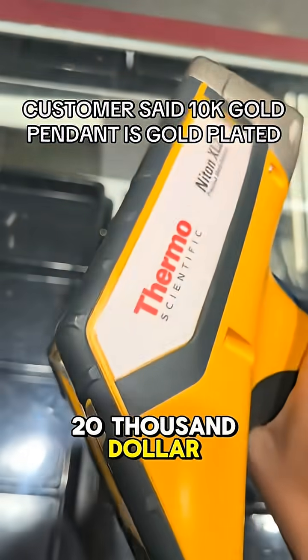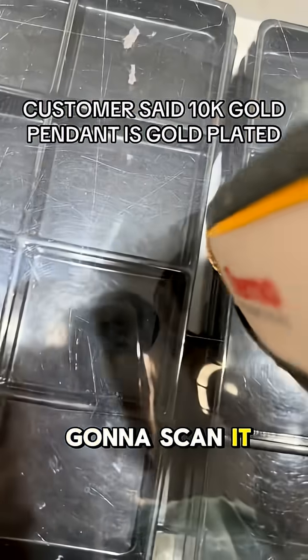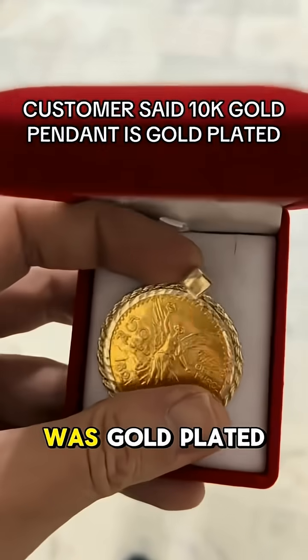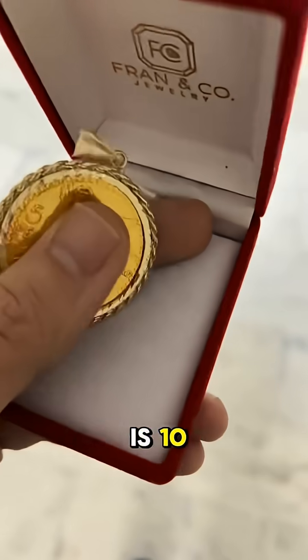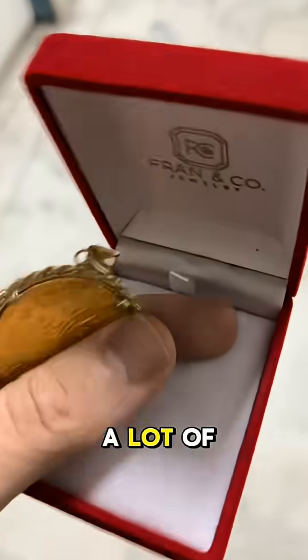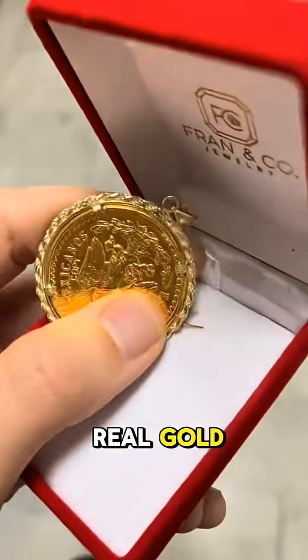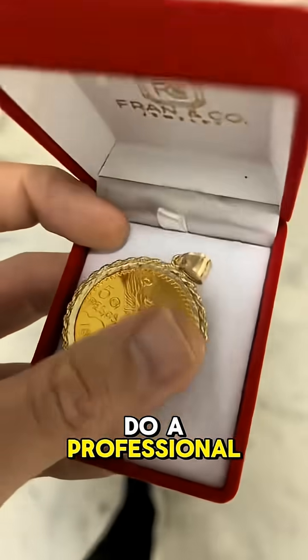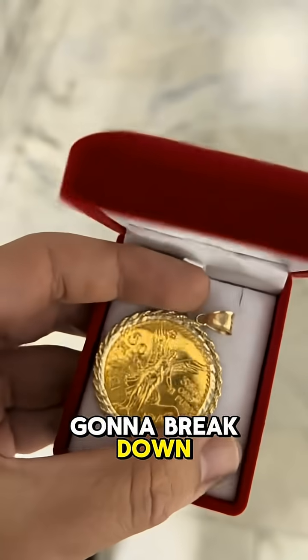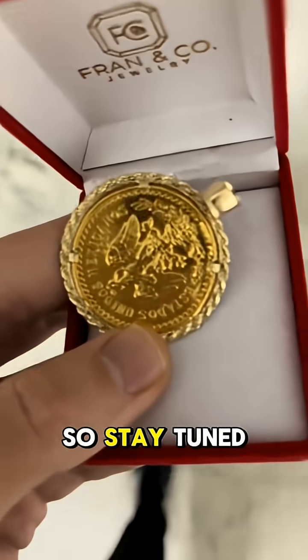We have this $20,000 machine here, and we're just going to scan it. I had a customer tell me that this 10-carat coin was gold-plated — that the bezel is 10 carat, but that the coin itself was plated — and they were pretty upset because they paid a lot of money for this. Obviously this is real gold, but we're going to do a professional XRF machine scan test on this, and this is going to break down the alloy metals for us, so stay tuned.